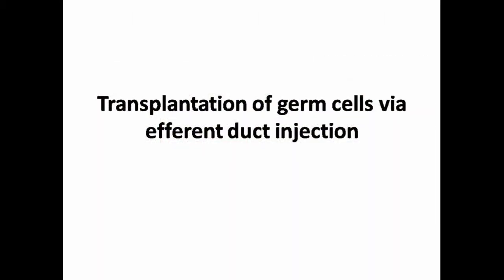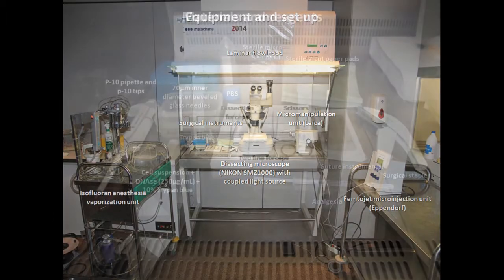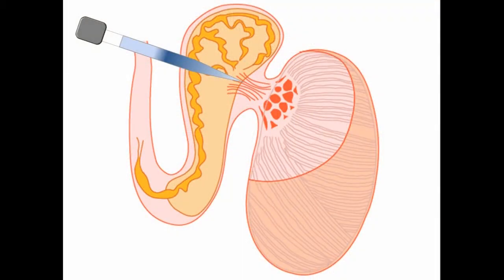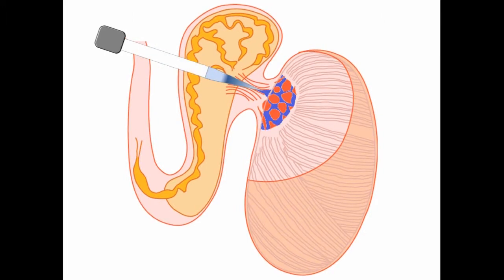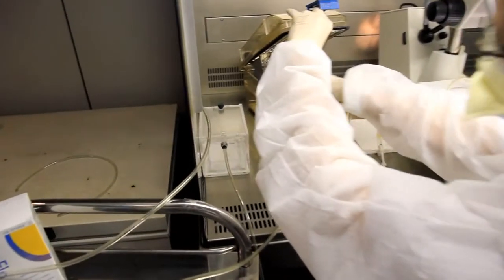After the preparation of recipient mice, we can proceed with the transplantation of germ cells. Here you can see the equipment setup that we use, along with other required materials and reagents. As donor cells, a good control of the technique is a freshly prepared suspension of mouse testicular cells at a concentration of 100,000 cells per µl, kept on ice during the process. Here you can see a schematic representation of the injection process: entering the efferent duct bundle and injecting cells into the rete testis to fill up the seminiferous tubules with the donor cell suspension.